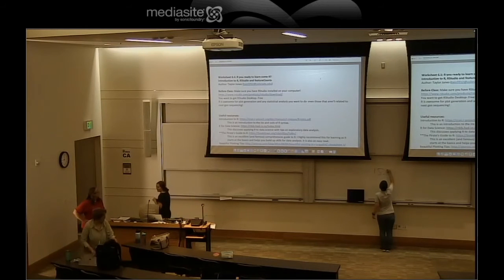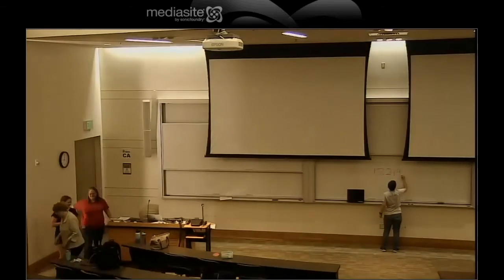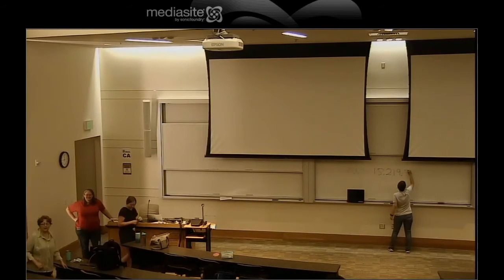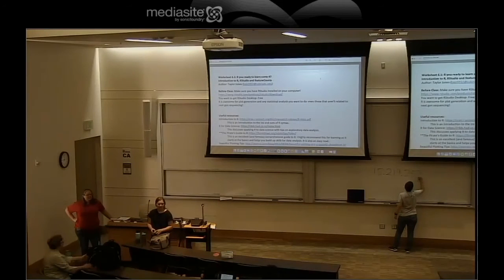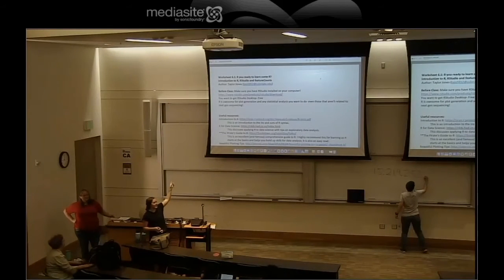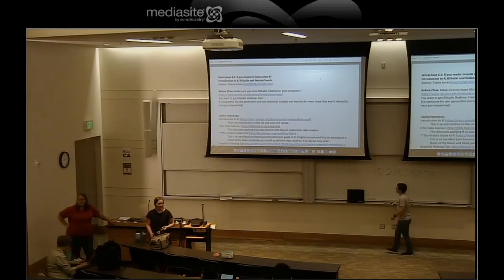Make sure you have RStudio if you don't yet. You should have done that over the weekend, hopefully. The link to install is in this worksheet if you did do it over the weekend. And you just want the free version, if you have either PC or Mac.